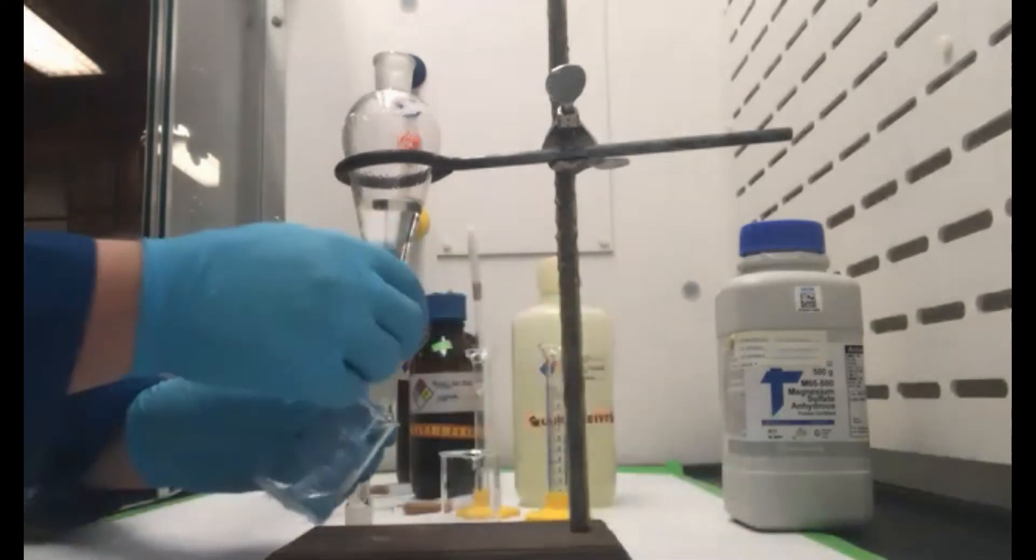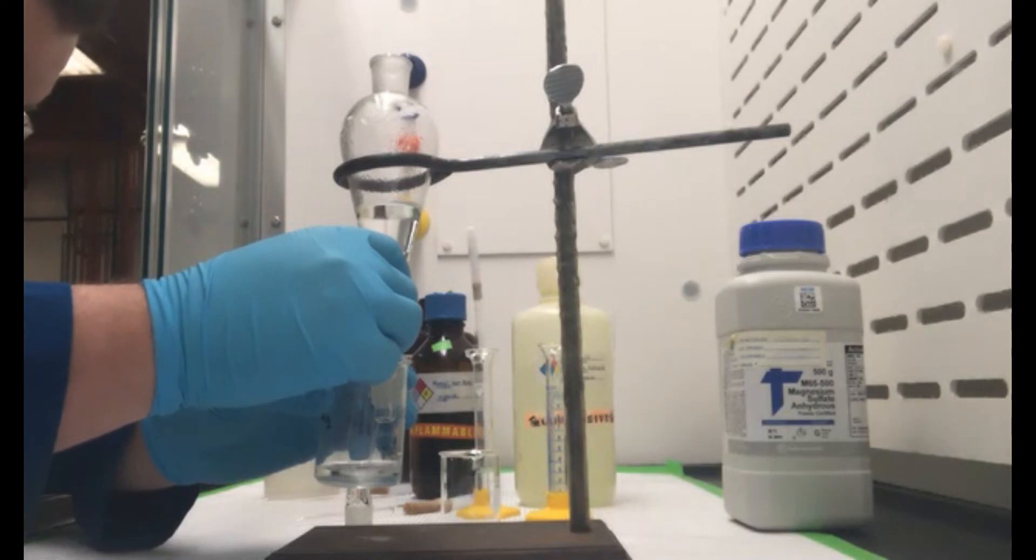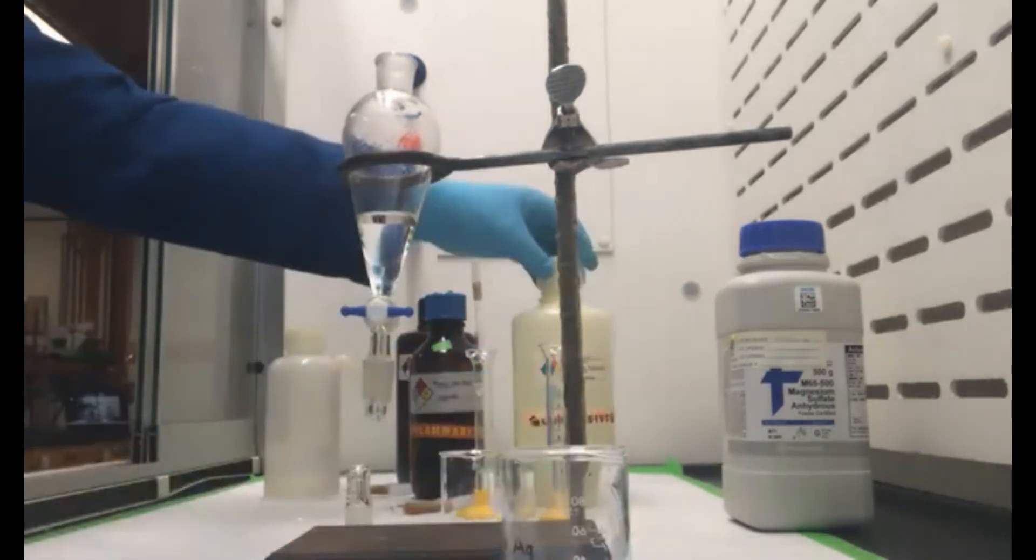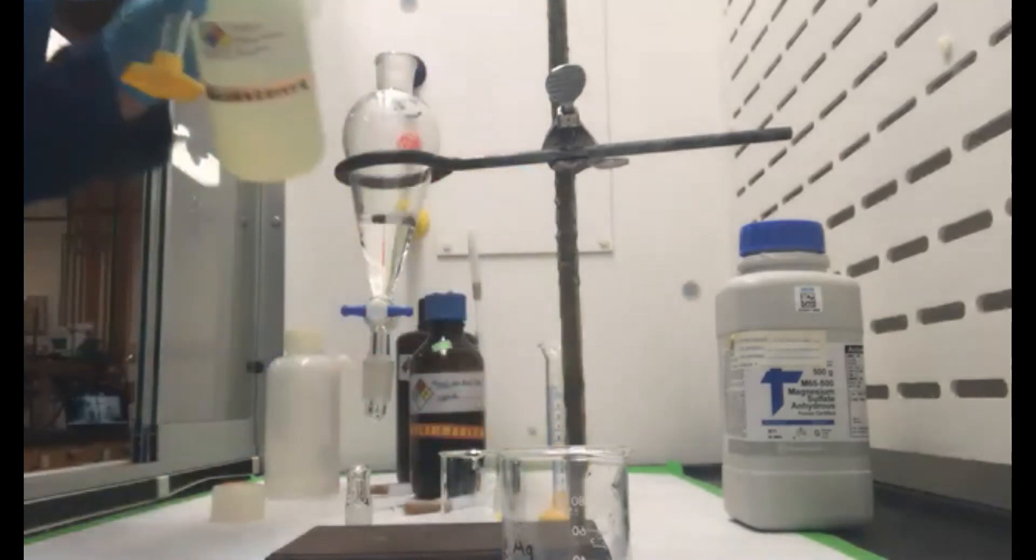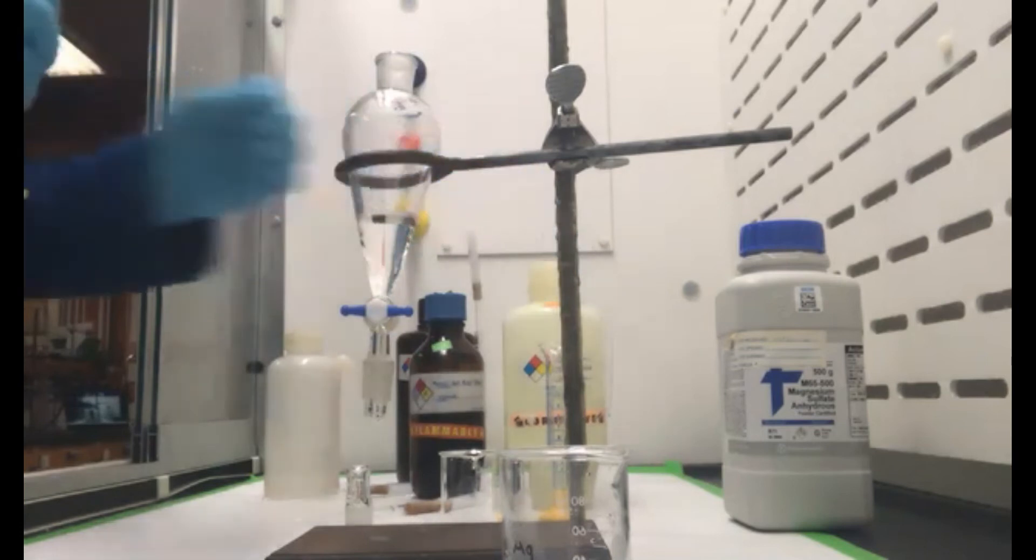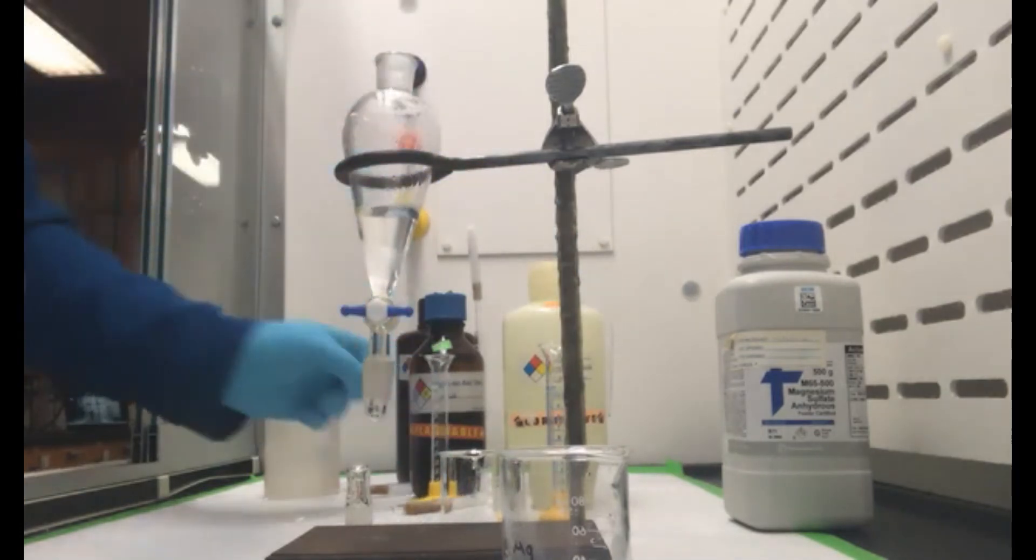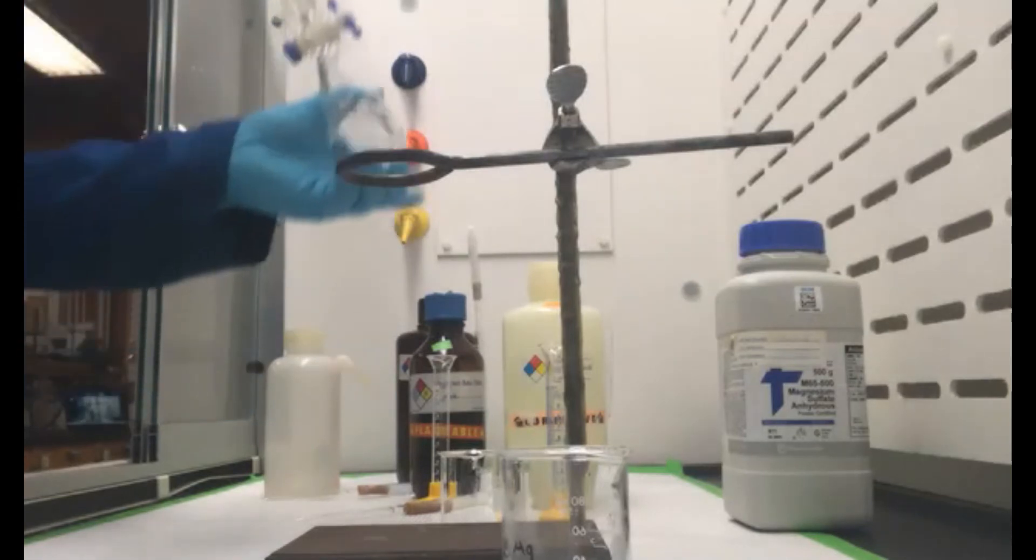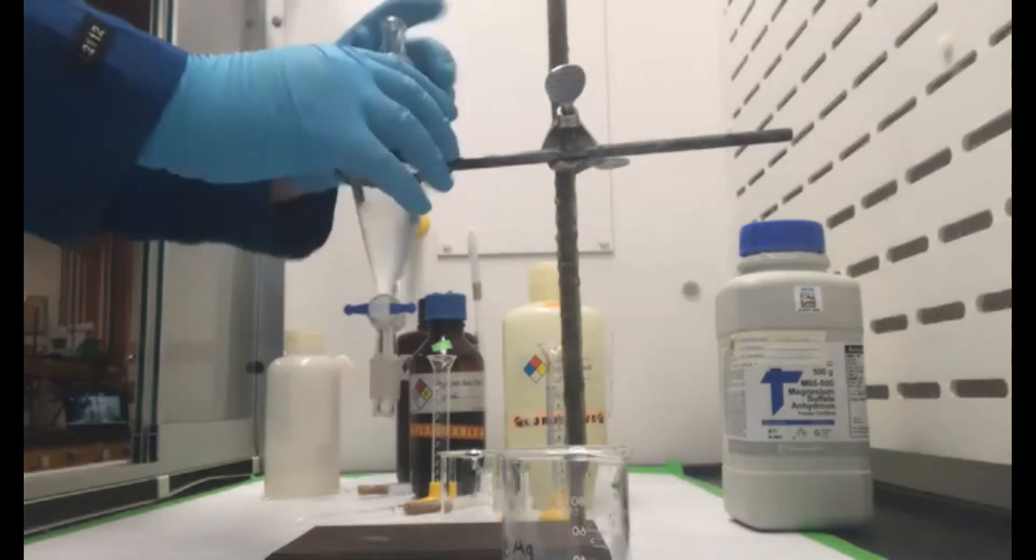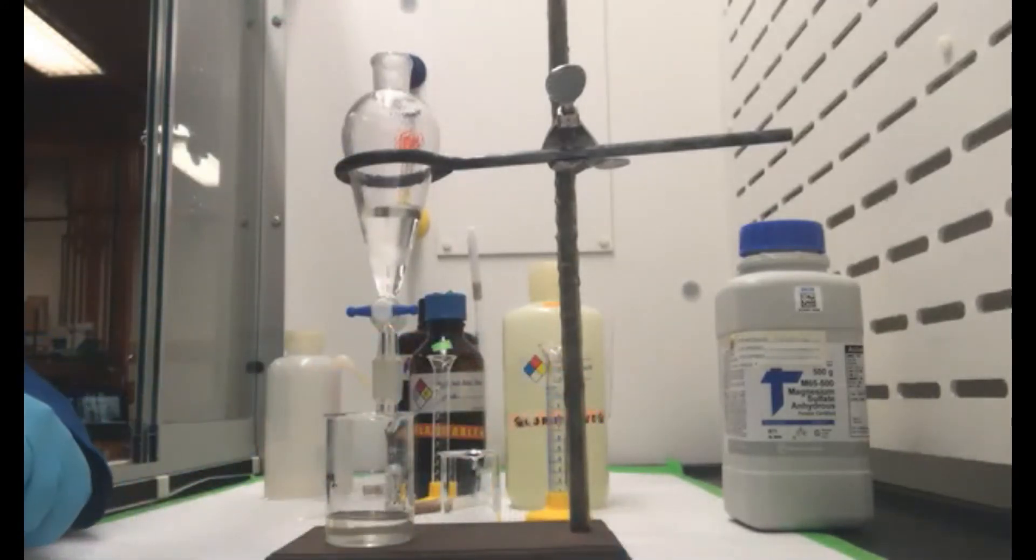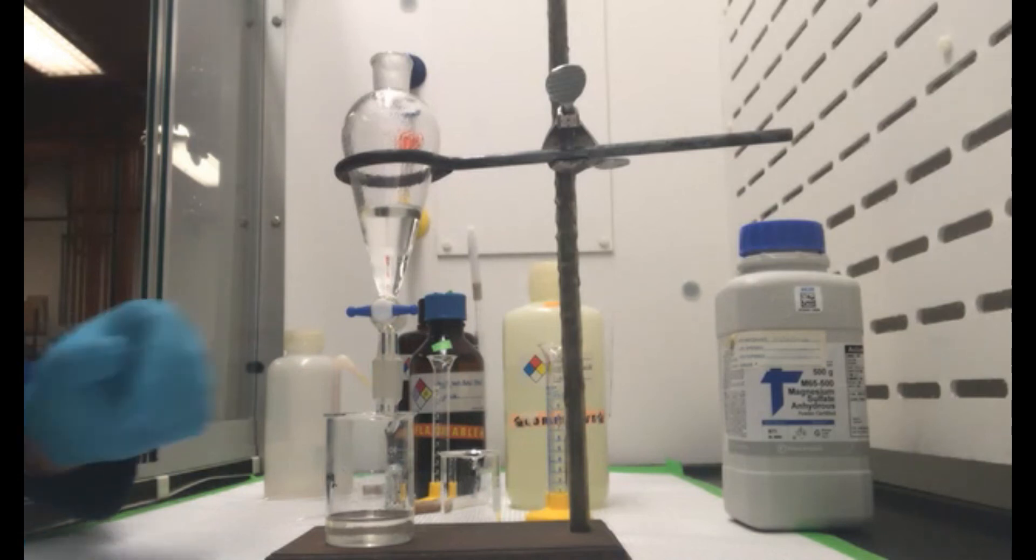All right, now we're going to go ahead and get rid of that aqueous layer. And we're going to add yet another 5 mils of our sodium hydroxide solution. We'll go ahead and wash that. We'll let that separate out. Then we'll remove the aqueous layer.